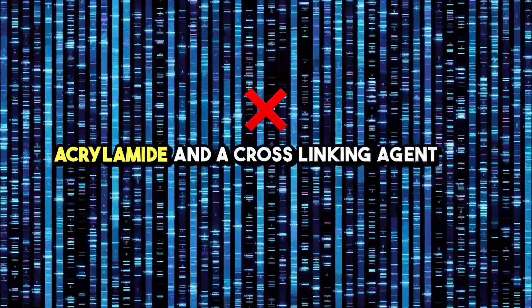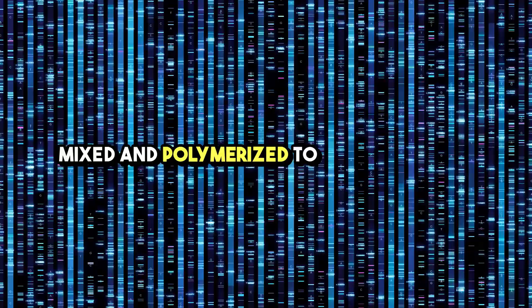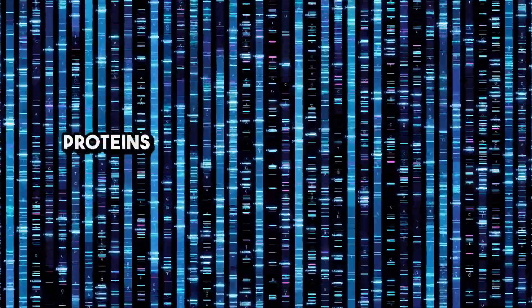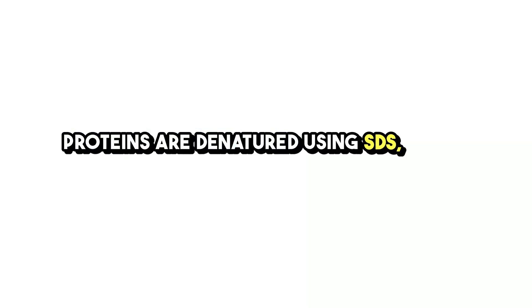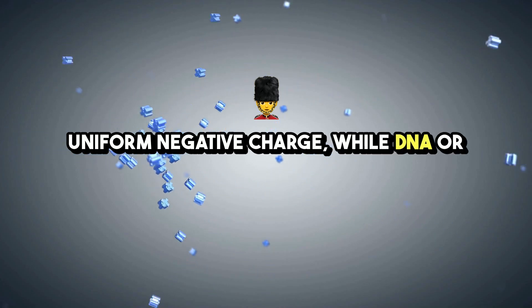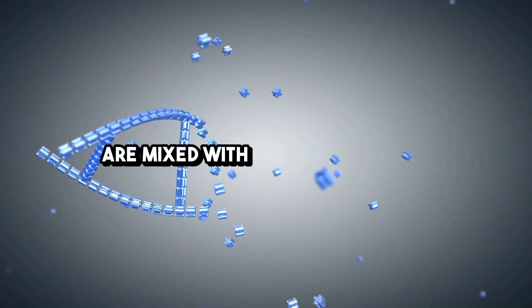Acrylamide and a cross-linking agent are mixed and polymerized to create the gel. Wells are formed for sample loading. Proteins are denatured using SDS, giving them a uniform negative charge, while DNA or RNA samples are mixed with a loading buffer.